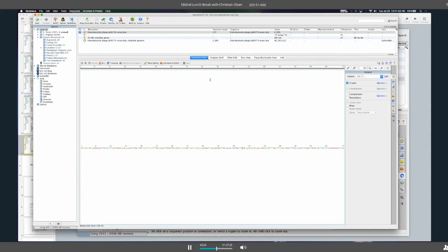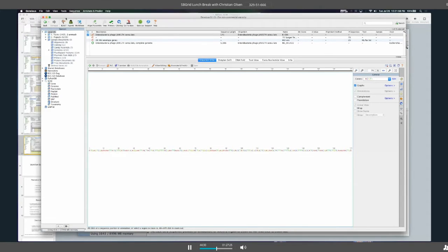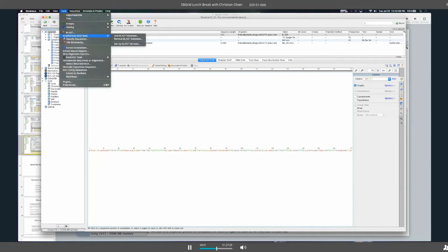Okay. Now, are there any questions about the custom BLAST database feature that I mentioned so far? If there are, please feel free to ask me, or again, you can save the questions for later. But the critical step for this is to set up BLAST services, which I have highlighted here. Okay, do that once for every machine, and after that, you can BLAST to your heart's content. Okay.